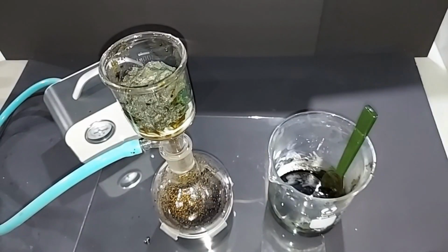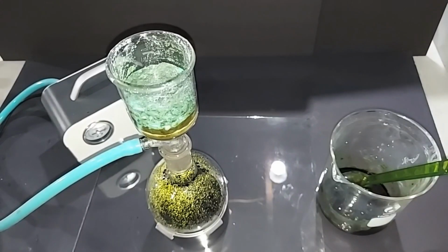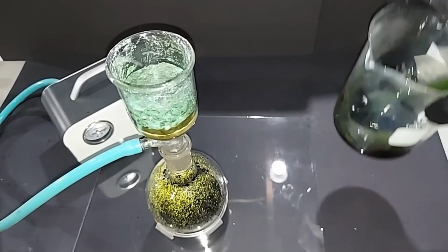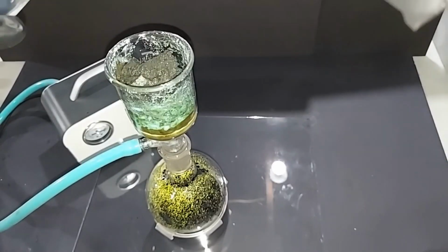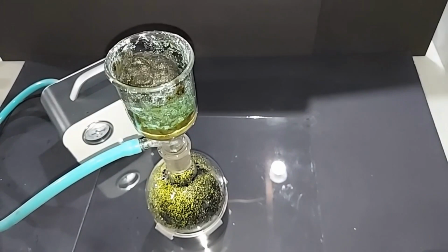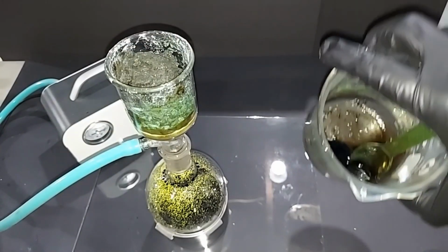Well, that's just over half of it. So I'll complete this whole process and then I'll be back. Well, the dripping has slowed down a lot, but what's also happened is that the volume on the top is greater, and I think at this point I can get all of it in there. Okay, that's it. This is all liquid in here.